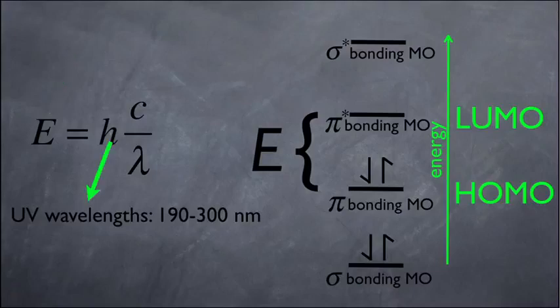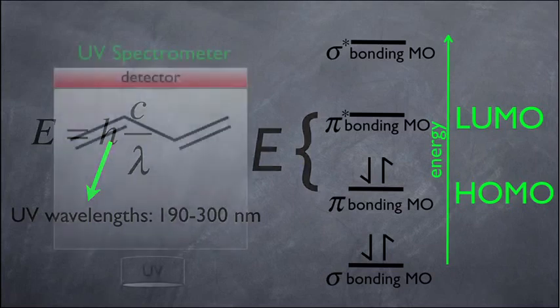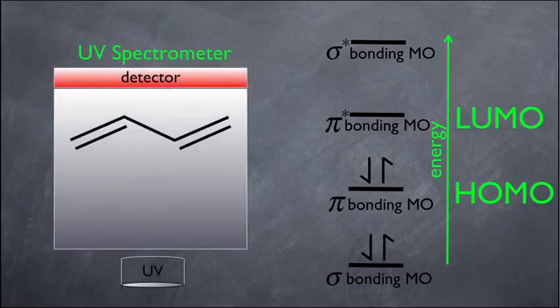So what am I saying here? What does this all mean? Let's go back here. Again, we shine various UV lights, right, with certain wavelengths at our molecule. Remember, the conjugated system will absorb light at UV wavelengths. And remember, we were trying to figure out why that's so. Well, remember, what happens is one of the electrons here in the HOMO gets knocked up here to the LUMO, all right?